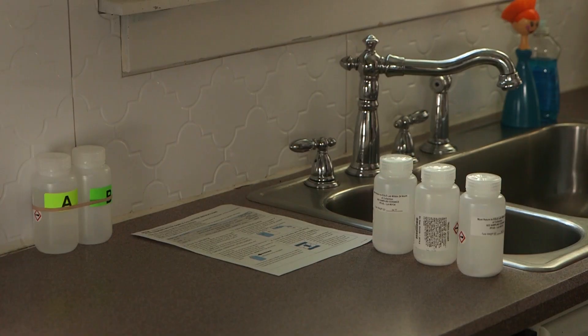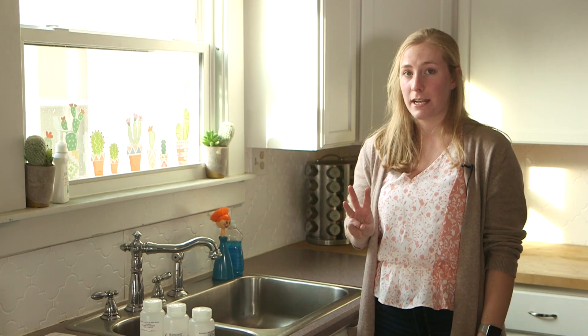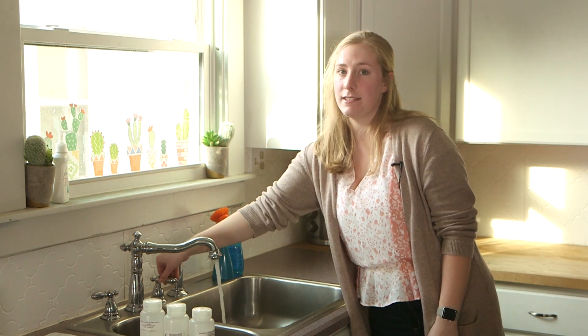Now that it's been 24 hours, you'll want to figure out a place to sample the water from. You should pick somewhere where you drink water frequently, like your kitchen sink. Place your three unmarked bottles in a row near the sink. You may also want your sampling instructions nearby. Now run the cold water for three minutes at full strength. You may want to set a timer.